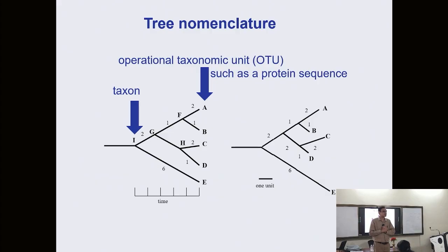So maybe different species can get grouped when you have this 97% threshold. Which is okay, and this is done these days for metagenomic sequencing and then classification of the organisms based on the metagenomic sequences.